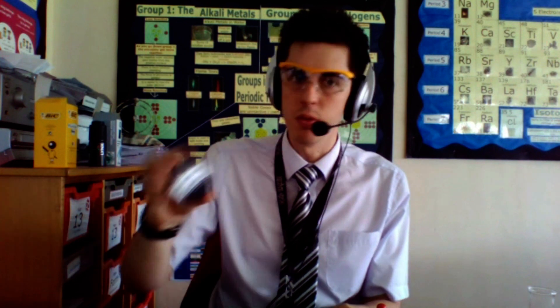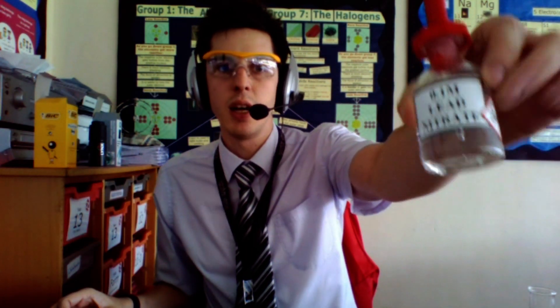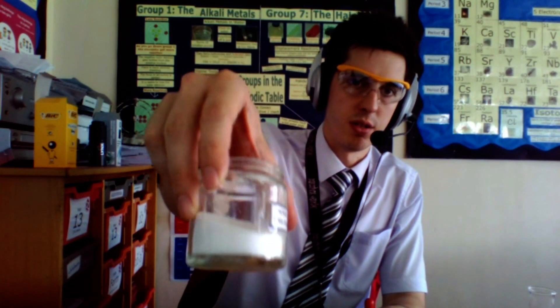If you want to make an insoluble solid the first thing you need to do is have your two soluble solids. In this case I'm going to be using sodium chloride and lead nitrate. Now the lead nitrate is already dissolved but the sodium chloride is not.